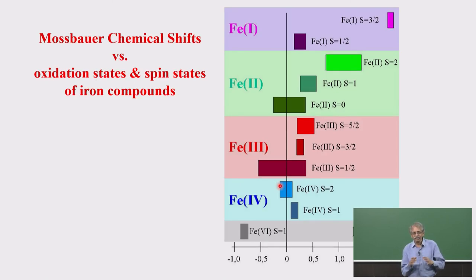I hope you got enough information on the Mössbauer basic principles. We built it, and there are three parameters. Basically, two parameters you use: one is isomer shift, the other is quadrupole coupling. Now, under a magnetic field, you can go further. That is the third parameter. With these three, you can get the compositions present even in composites, nanomaterials, regular compounds, different spin states, and oxidation states together. This is very important, because a lot of these iron materials are used in magnetic sensors, etc.